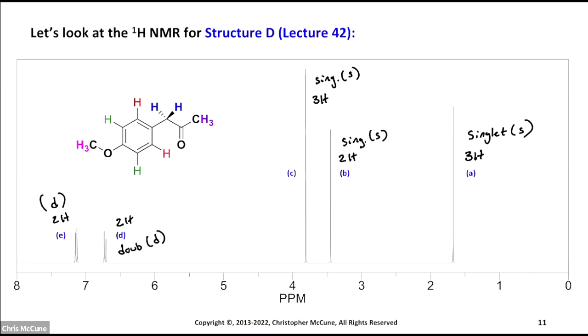And the last thing we have to do is assign each letter, each peak, to the right set of hydrogens. Okay, so maybe you can do that already. And maybe you can look here and say, okay, this carbon is attached to a carbon that has no hydrogen.